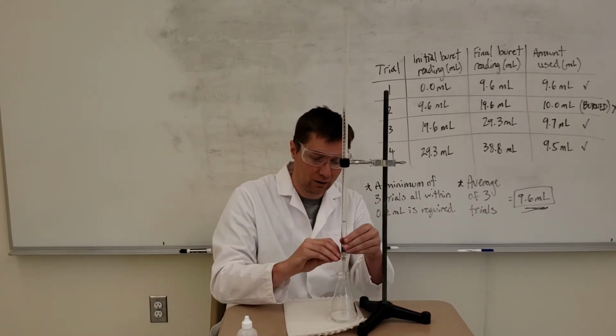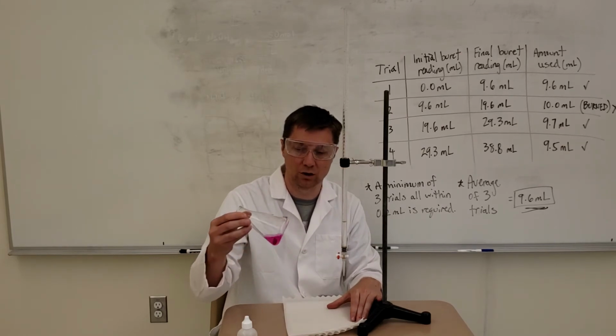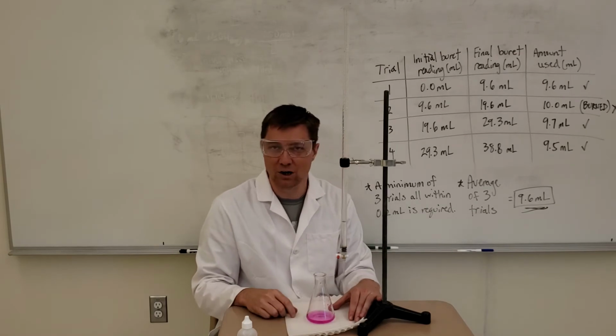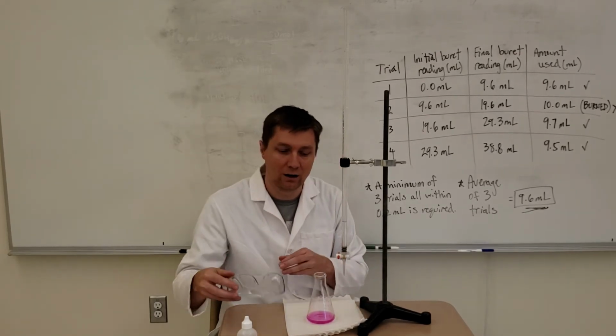And so if we take a look at what the burned solution would look like, even just one or two more drops here, you can see that this is going to end up that dark pink, and that's not what we're looking for. So I hope this is helpful, and it gives you a visual of what titrations look like and how to do them.